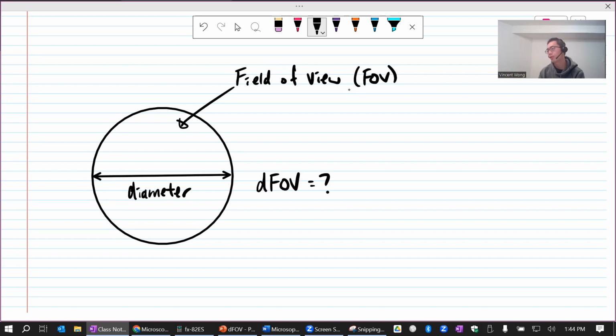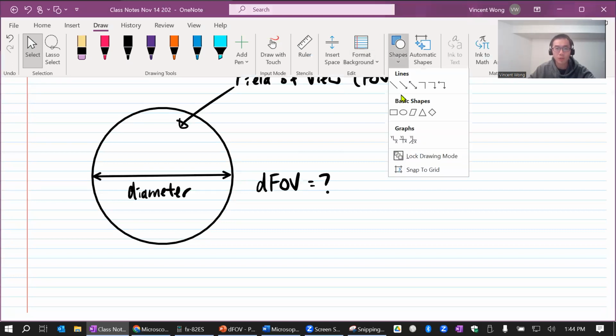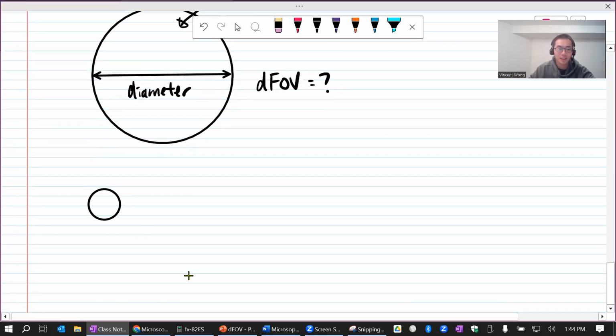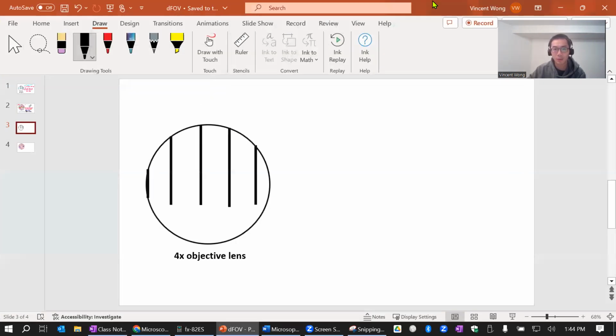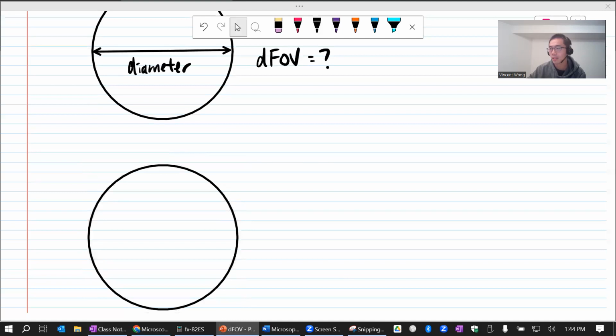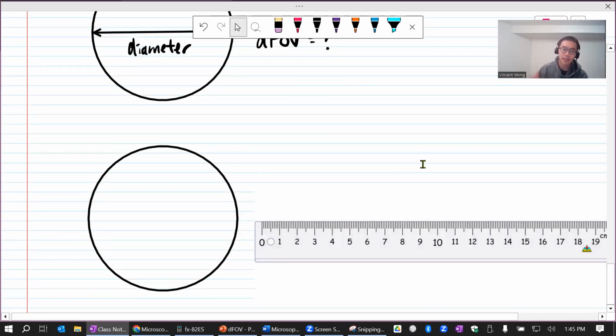How should we measure that? What do you think? If we want to measure the length of something, what tools do we use? It's not a trick question. Just say whatever comes to your mind. Yes, we use a ruler. That is correct, okay? Now that might sound deceivingly simple, but it's not. You are gonna stick a ruler under the microscope, right? Like when my class does it next week in person, they will be taking a ruler and sticking it under the microscope. Now, let's understand how the ruler works. To your surprise, many people actually don't fully get it.